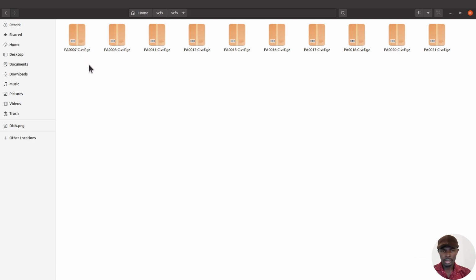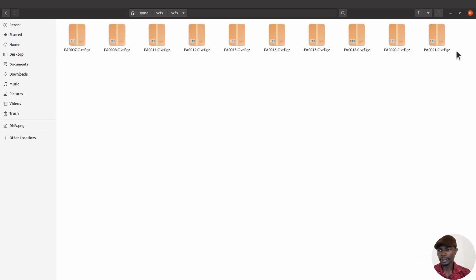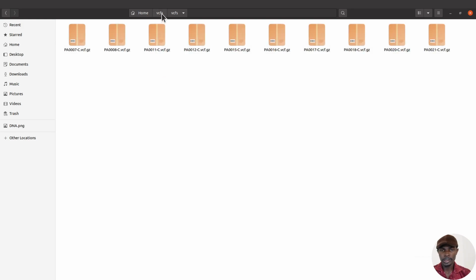All right. So here, for the script that we are going to use, you need to add more commands to it because we have the samples in separate files. So we'll have to write a script that will get the counts in this file, this file, this file, all these files, and then aggregate them together for us.